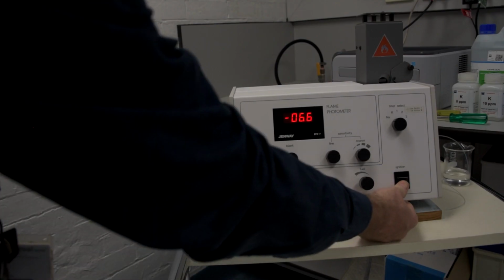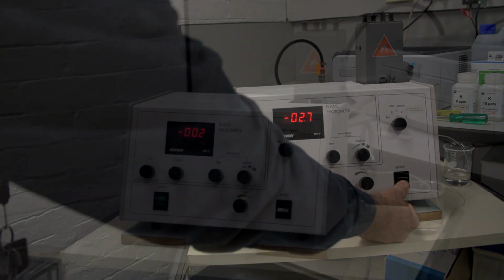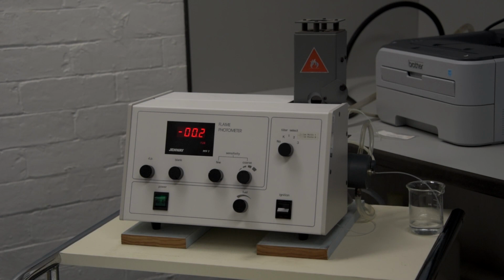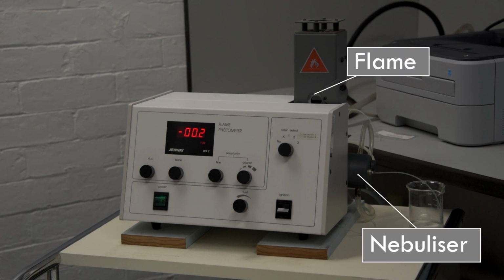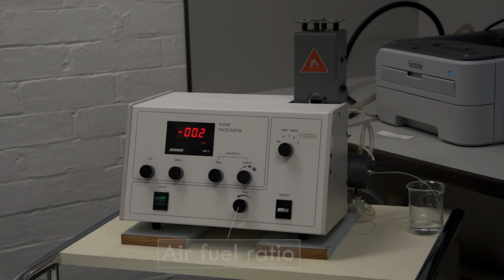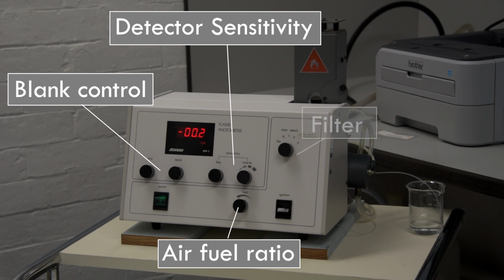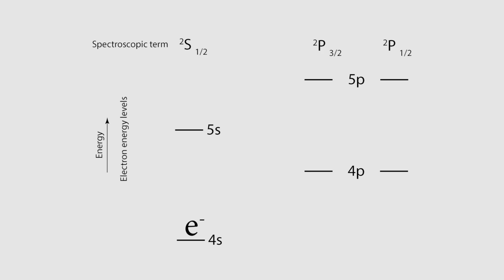Once the sample and the standards were prepared, it was time to run them on the flame atomic emission spectrophotometer. Flame atomic emission spectrophotometers are simple instruments when compared to flame atomic absorption spectrophotometers. In the case of this spectrometer, all controls are available on the front of the instrument. These include the air-fuel ratio for controlling the temperature of the flame, the blank control for adjusting the blank for the background emission of the flame, the detector sensitivity, and the optical glass filter.